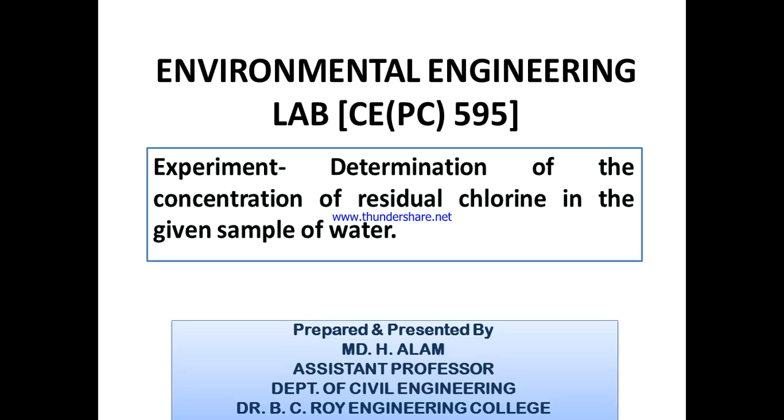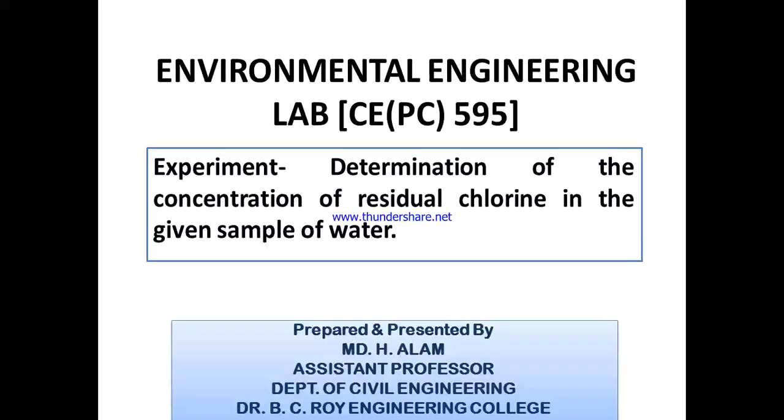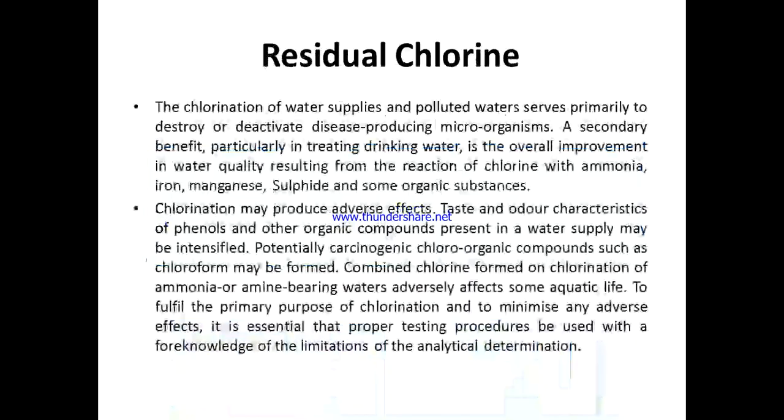consumption. Okay, water. So today we'll be learning the steps to determine the concentration of residual chlorine in the given sample of water. Okay students, so I have made you understand what residual chlorine basically means. So let us see a little background of residual chlorine.